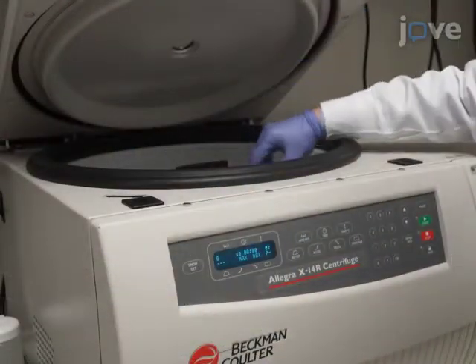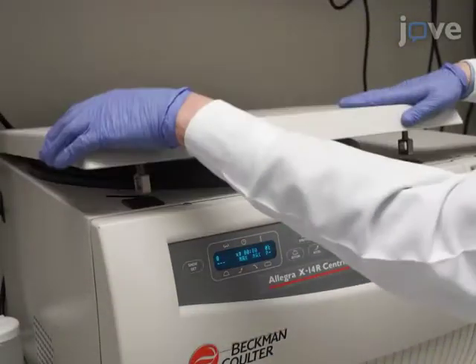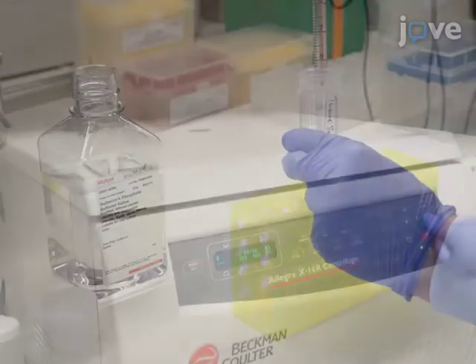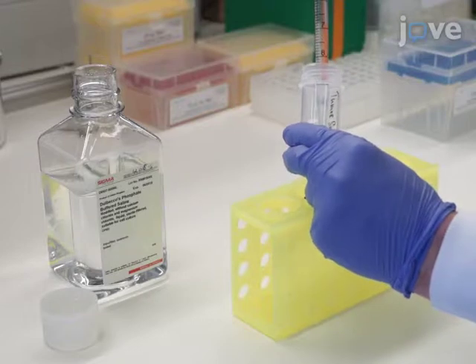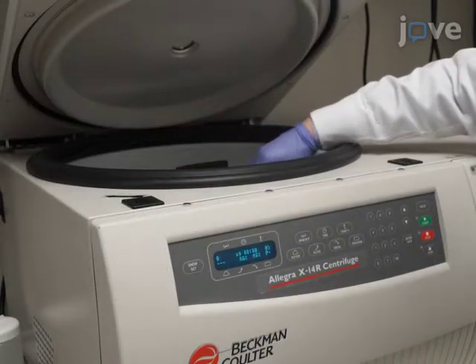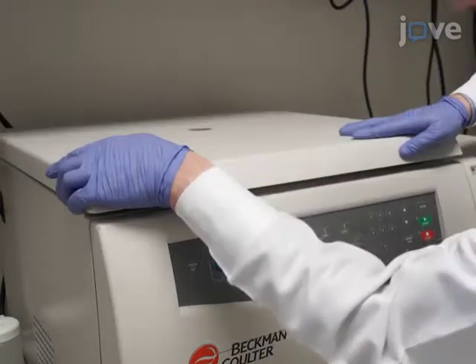Spin the sample at 934 times G for 5 minutes at 4 degrees Celsius using a benchtop centrifuge. When finished, remove the supernatant and add 5 ml of ice-cold PBS. Then, centrifuge the sample again at 934 times G and remove the supernatant.